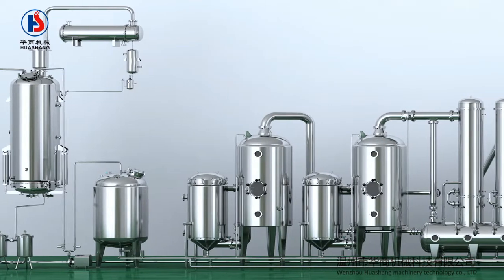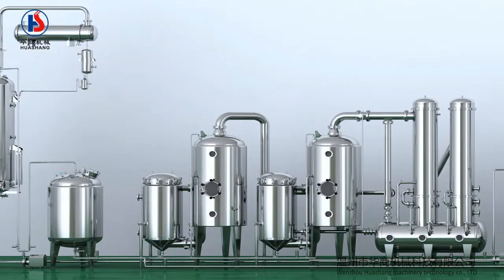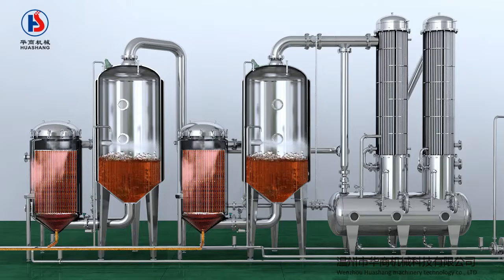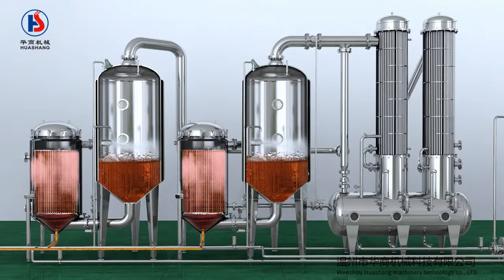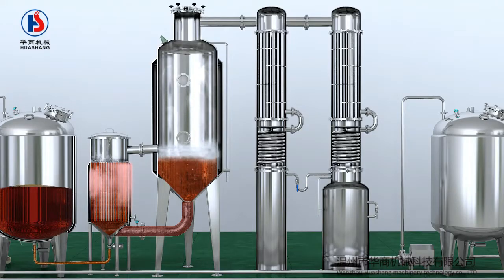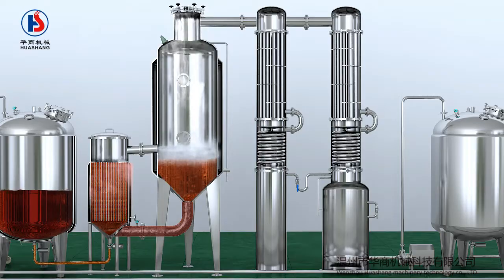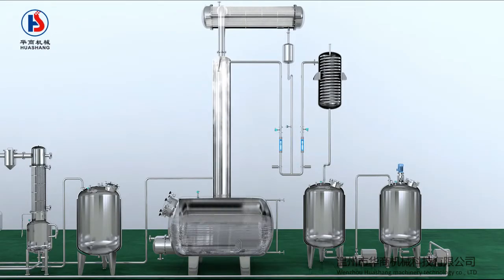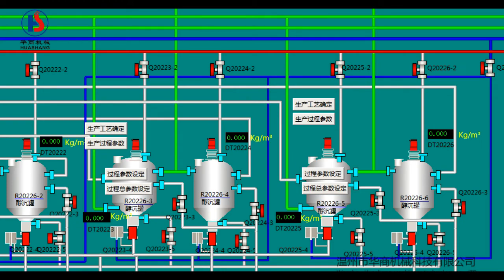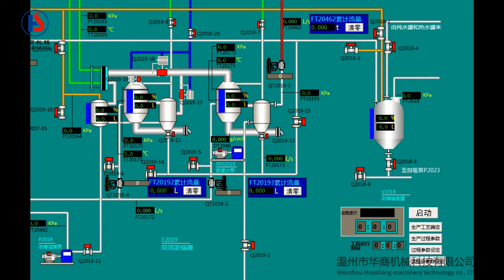The automatic production line of extraction and aspiration process realizes the automatic control of extraction, concentration, alcohol precipitation, separation, recovery and other production processes. The main functions of this system are real-time detection, control and alarm of precise technological parameters, and single-loop or cascade control of temperature, flow, pressure, liquid level, and concentration.